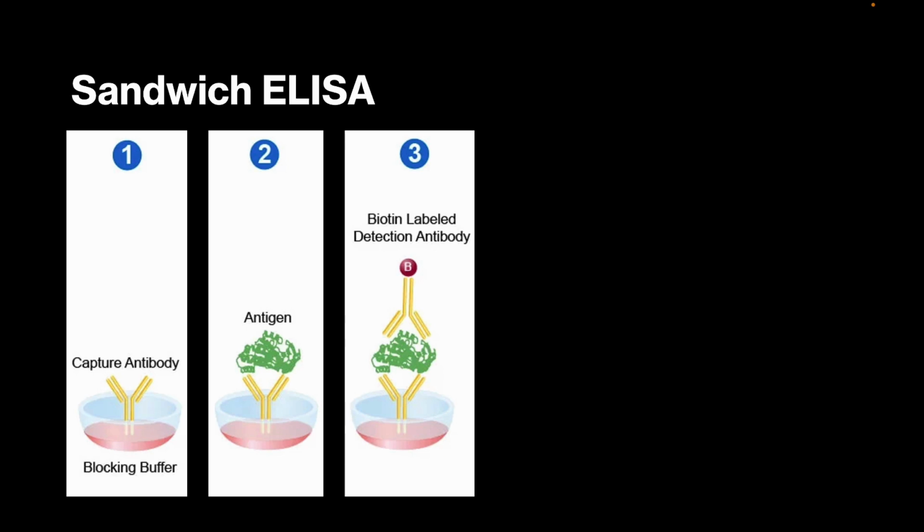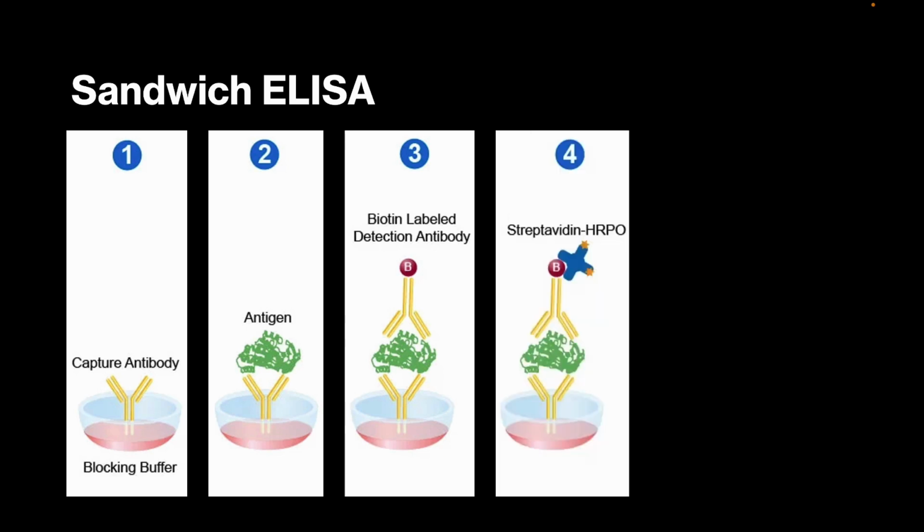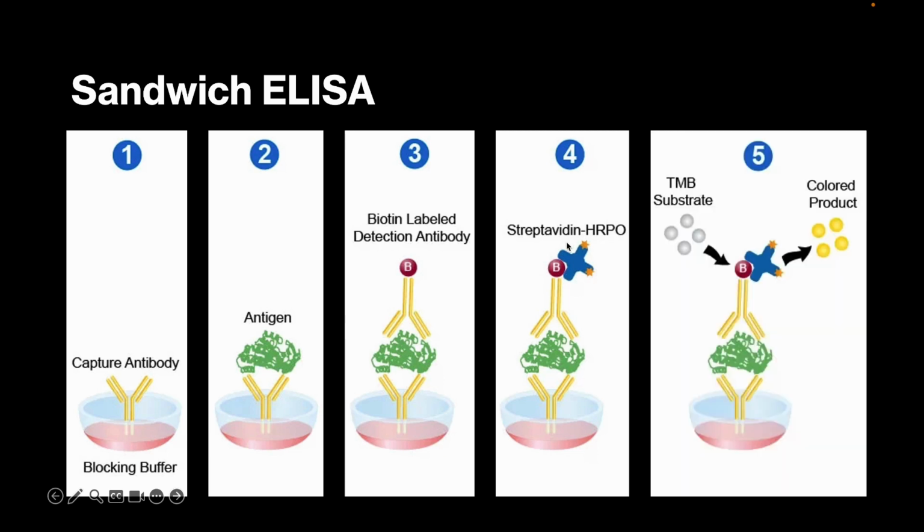And then we put another antibody, the secondary antibody, which can be streptavidin HRP or any other secondary antibody like we have talked about. And then we put the substrate, right? Because now we have the enzyme tagged. If we put the substrate, and the protein is present and this complex is formed, the substrate will form the product which is in color. So now we can identify the color of the reaction, right?